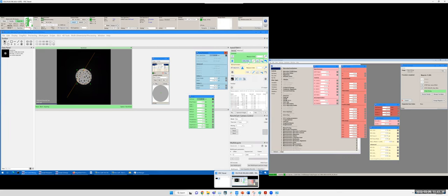We want to go to 100% for the probe aberration. So let's measure again. You can see there's a percentage. Normally I look at the percentage. I want to make sure all the controls are okay. Actually, after they are 100%, in the new version of Swift, it shows done. So it will tell you it's good now. If not good, it will show you something like 80%. So normally you're looking for 100%, because you can always change the astigmatism. So you worry less about this. You worry about all the other values. They should all be 100%.